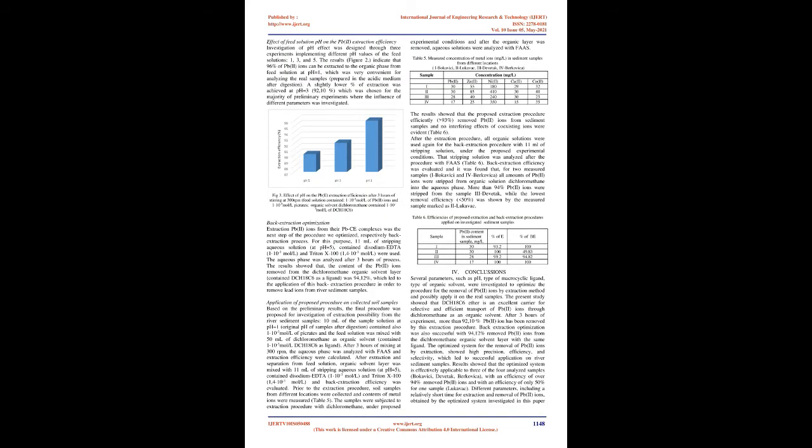The lower viscosity of DCM, 0.41, compared to 1,2-DCE and CH, 0.84 and 0.56 respectively, probably contributed to better solvent ability to extract analyte ions, due to less resistance to movement within the liquid, which affects the removal of metal ions from feed solutions. Also, the lower dielectric constant for DCM, 8.93, compared to dichloroethane, 10.66, contributed to more efficient extraction, by stabilizing ionic pairs which are formed and transferred to the organic solvent layer where complexation takes place.